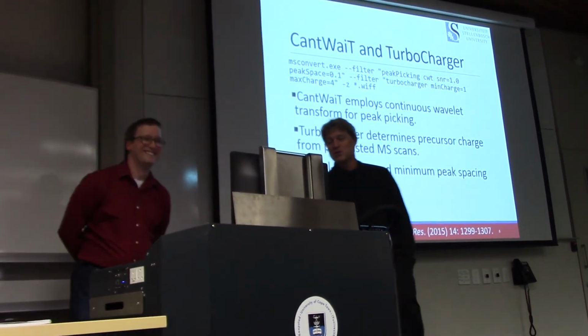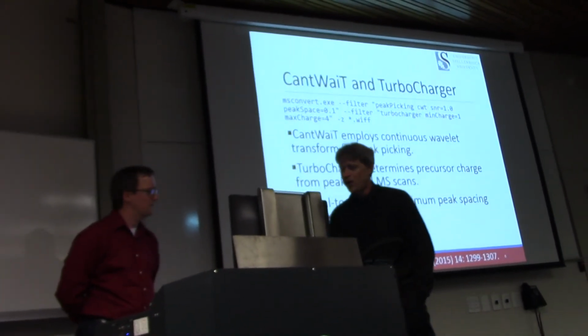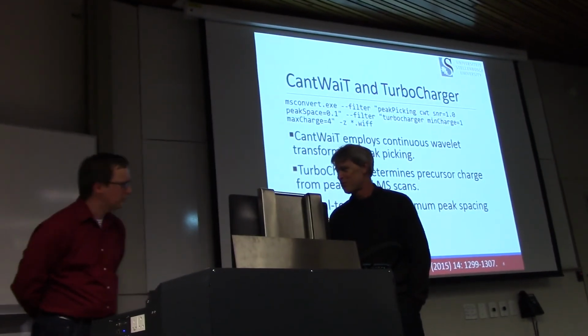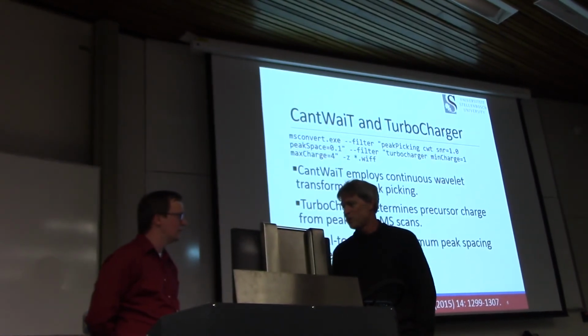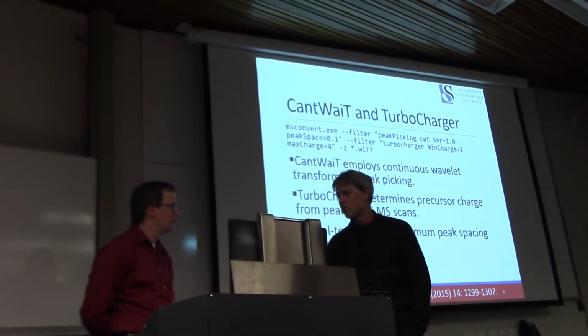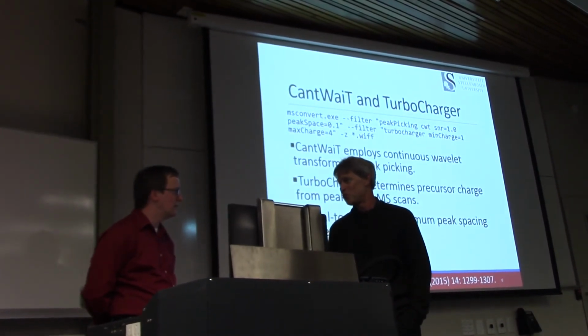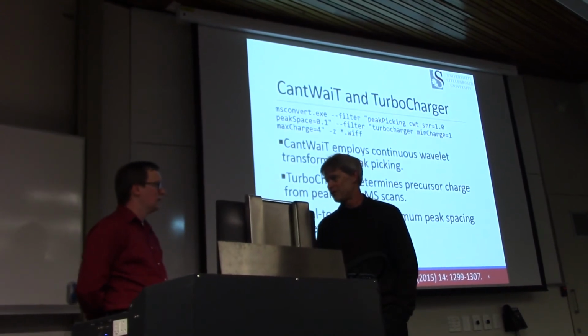So my question was going back to one of your slides, where you're talking about the mass tolerance that you were setting for your searches. And you said because you're in a position where you want to get everything, not just the really good bits. But isn't there a potential problem with analysing high quality, low mass tolerance data with a wide mass tolerance? Aren't you going to increase your false hits in that data set?